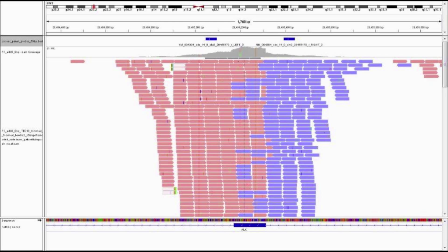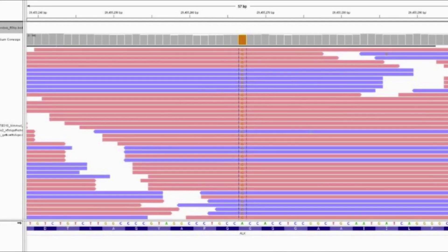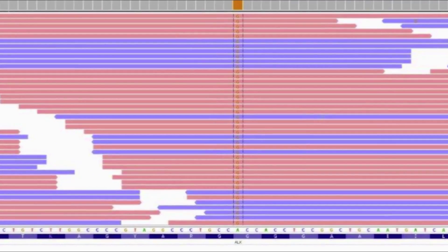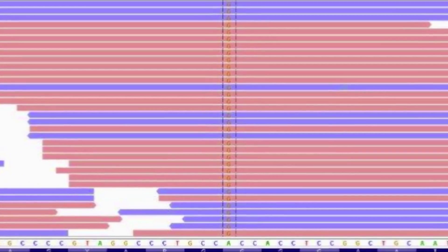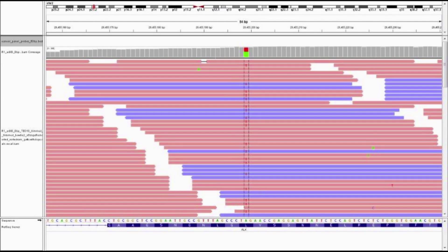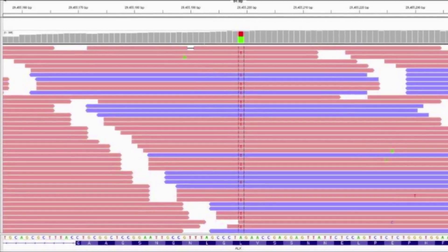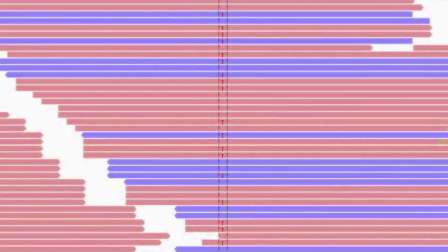If we zoom in to another target, we can visualize the actual SNPs within the reads. For this target, we have called one homozygous SNP as well as another heterozygous SNP.